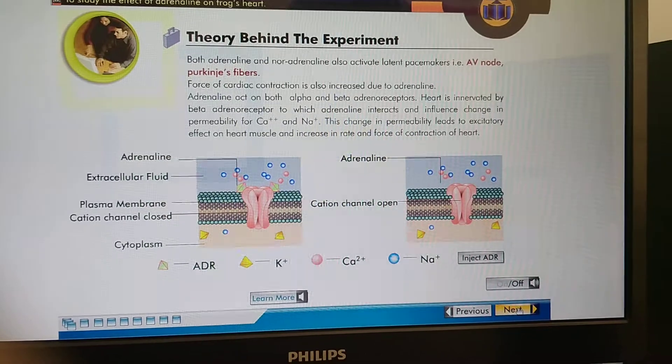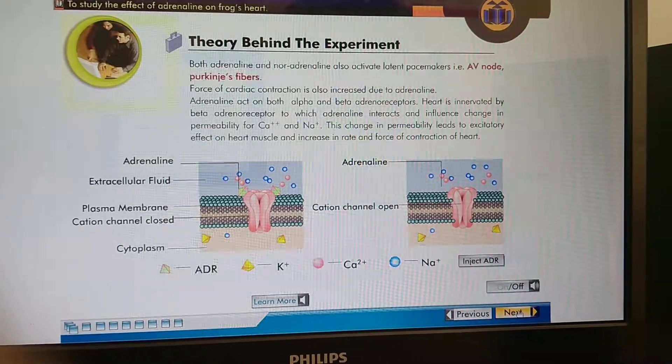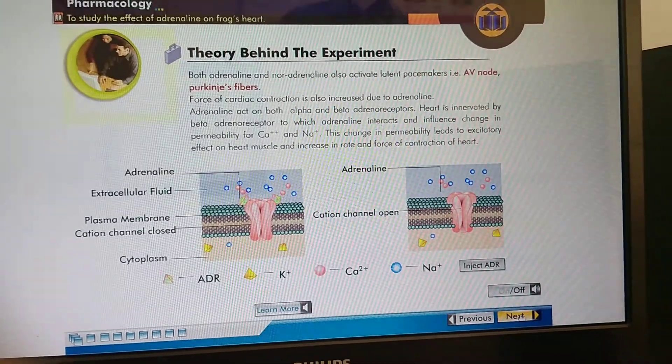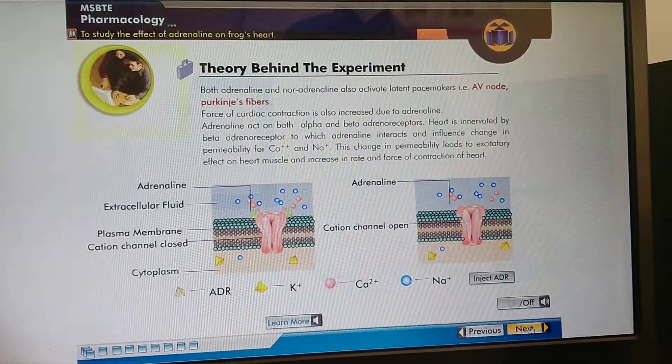These latent pacemakers include the AV node and Purkinje fibers, and they also increase the force of cardiac contraction.